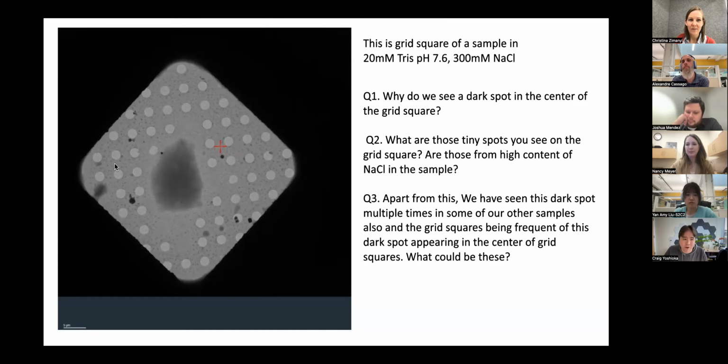I think all the centers get a lot of questions from users: how much data can you collect per unit time? And I always say it's very variable, and this is one of those variables that's super important. So I'm not making it up, it's like a 2 to 4x difference in throughput from just something like this.